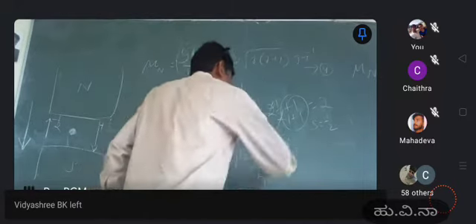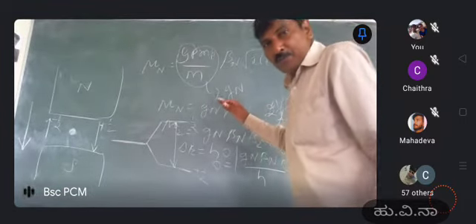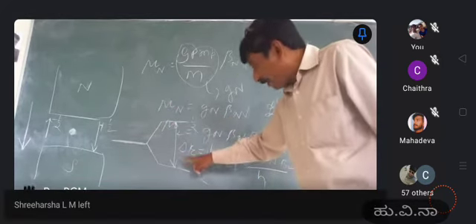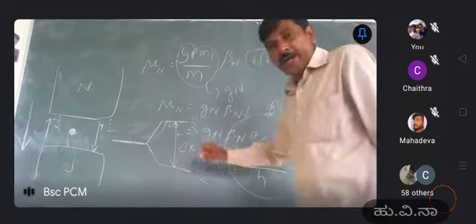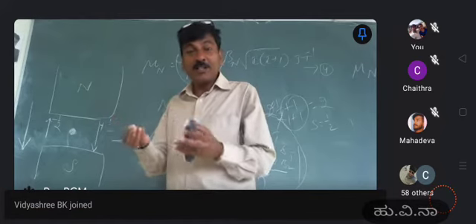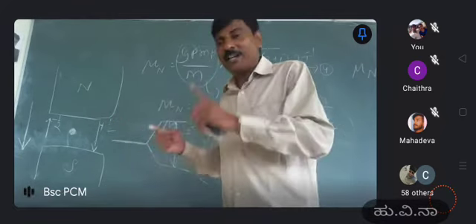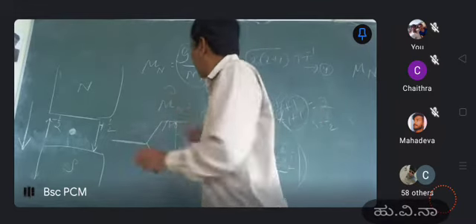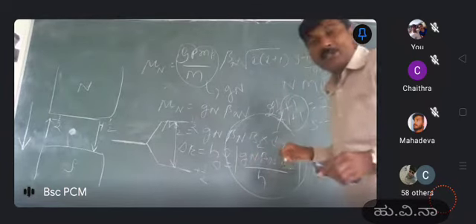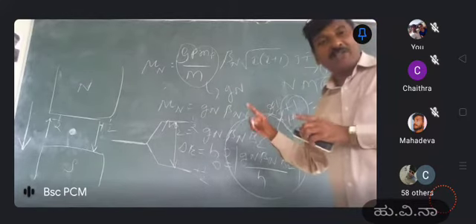Whenever you pass radio waves towards the nucleus and the radio frequency is exactly equal to this, the nucleus starts responding and absorbing those radio frequency waves. We call that resonance, the N in NMR. Then only do we get NMR signals.